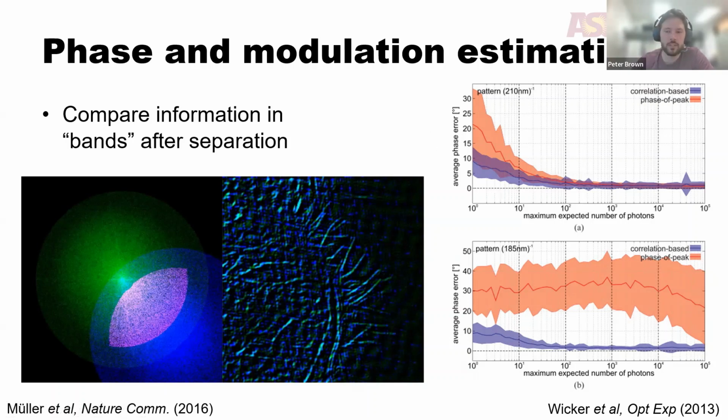In fact, the natural thing to compare this approach to is if we were to just take the phase of the SIM peak in the Fourier transform of our data image. And of course, that SIM peak will have a phase that's related to the SIM pattern, but in addition, there will be signal at that same frequency coming from the object spectrum as well as noise that can change this phase somewhat from the actual SIM pattern value. And so in that case, just looking at this peak phase will not give you the correct angle, but looking at this correlation still will.